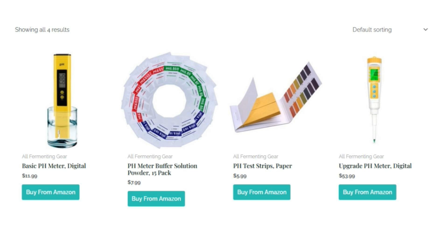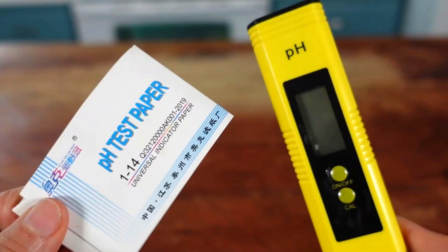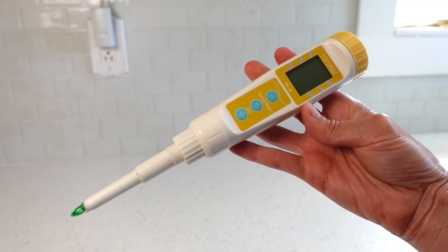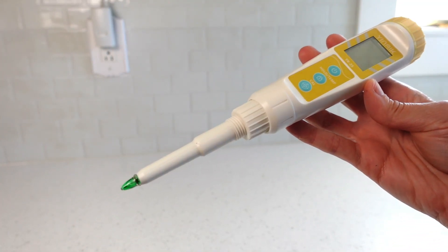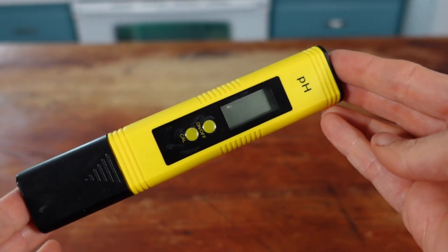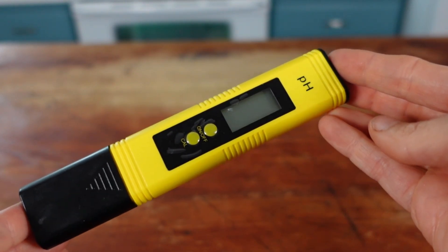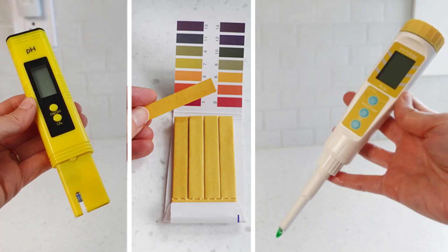I know many of you gasped at the price — I did too when I was first pH meter shopping a couple of years ago. Here's my advice: if you are new to fermentation and aren't sure if you and fermentation have a future together, or if your budget is tight, go for economical. You can always grow into upgrades later. However, if it is affordable to you today, save yourself the hassle of the lesser quality basic meter and go for gold with the upgrade. I used the basic meter for two years before upgrading and went through about five of them in those two years because they are, to be honest, cheaply made. But it's okay to start where you need to start — whichever pH reader you choose, paper strips, basic meter, or upgrade meter, it will get the job done.